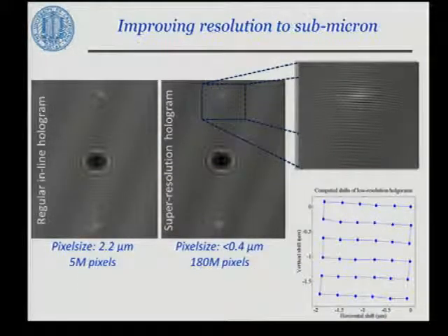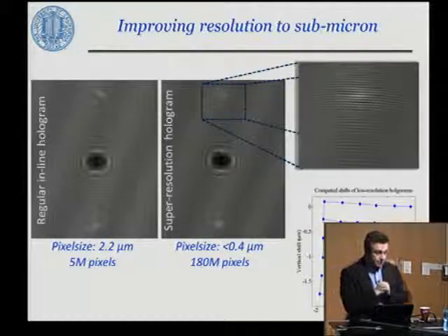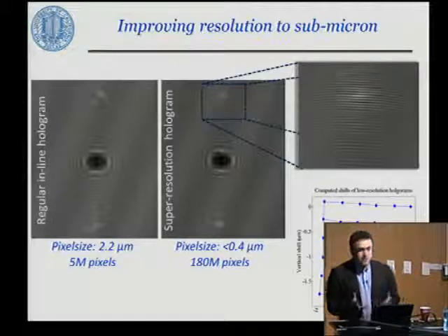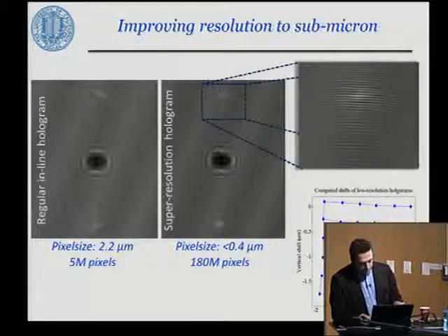One thing that's important here is that you do not need to know the subpixel shifts in advance. It doesn't come from the hardware. It's actually understood from frames by essentially cross-correlation. And that means these kinds of devices do not need to be calibrated, which is very important because calibration in field settings will be very difficult under different temperatures. So it's self-calibrated through reconstruction.